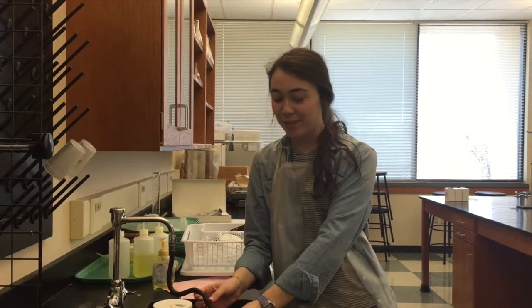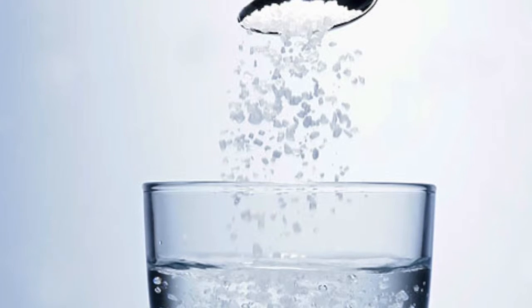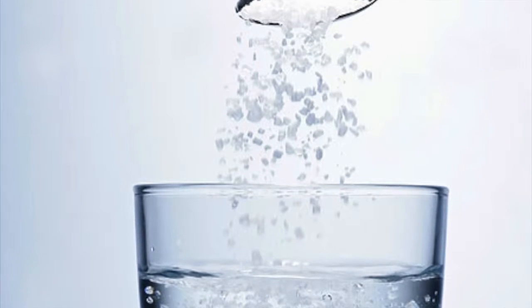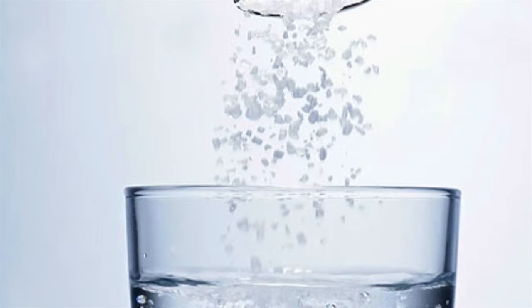I heard salt makes water boil faster. That is a myth, and we're gonna bust it. In this lab, we're testing whether or not adding salt to water will cause the boiling point to increase. The solute, salt, is non-volatile and therefore should cause the solution to have a higher boiling point than that of the solvent, water, by itself.